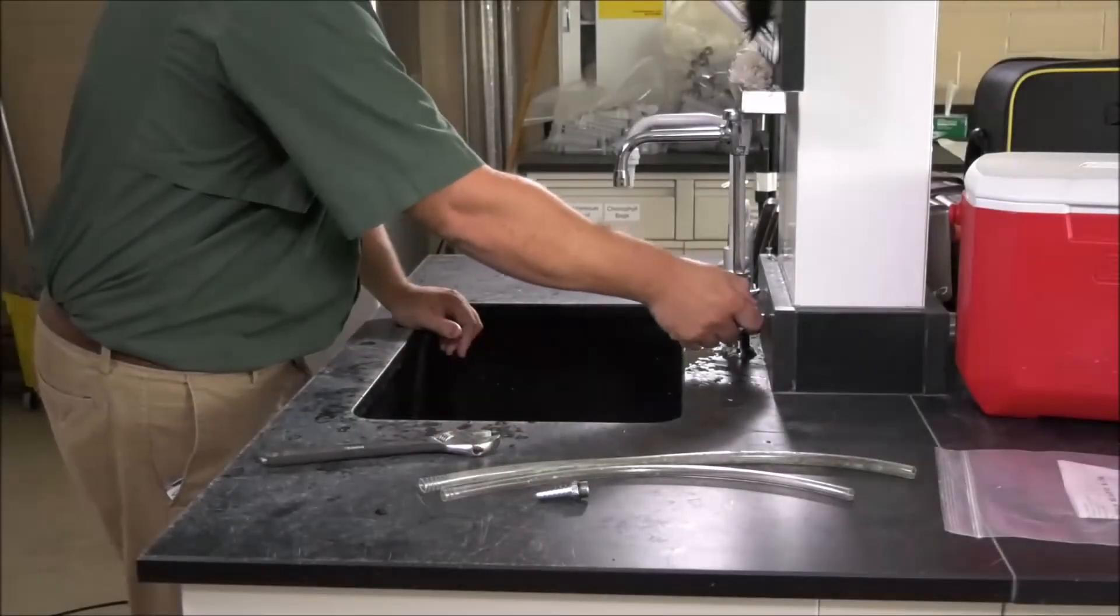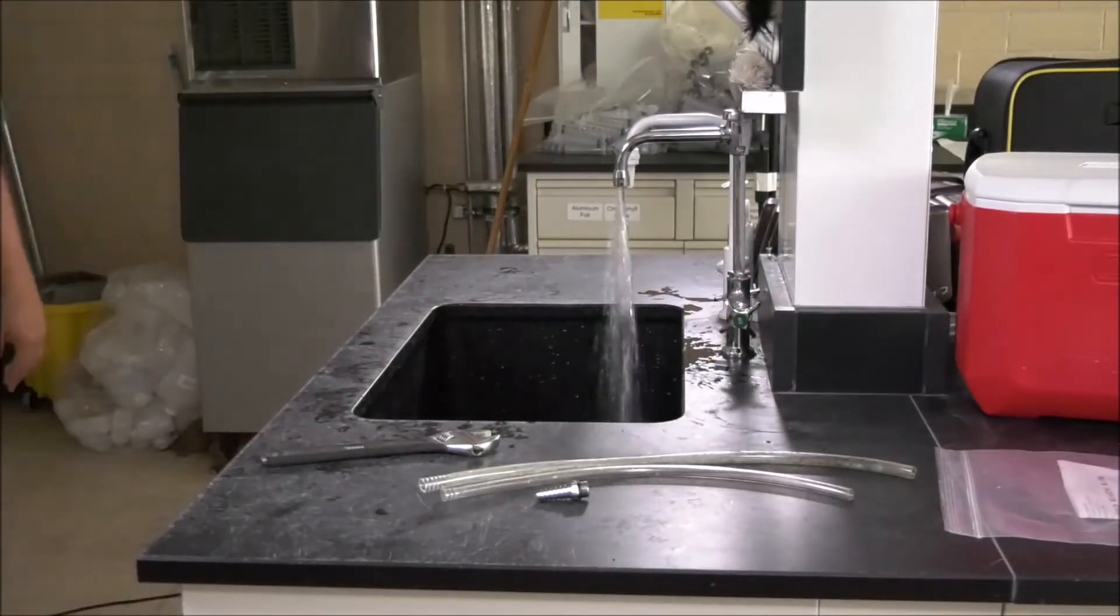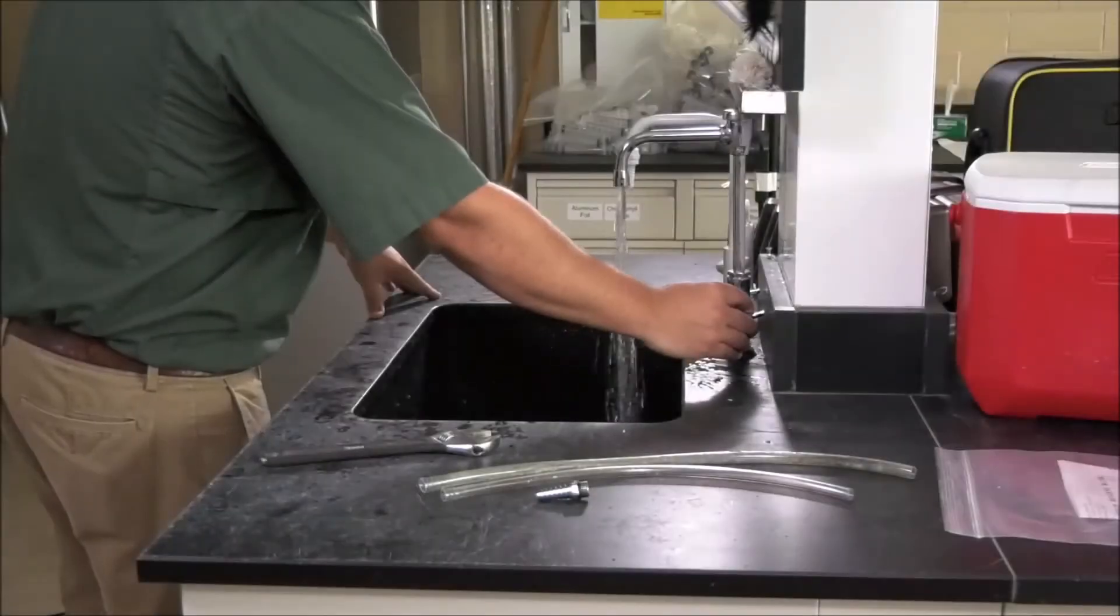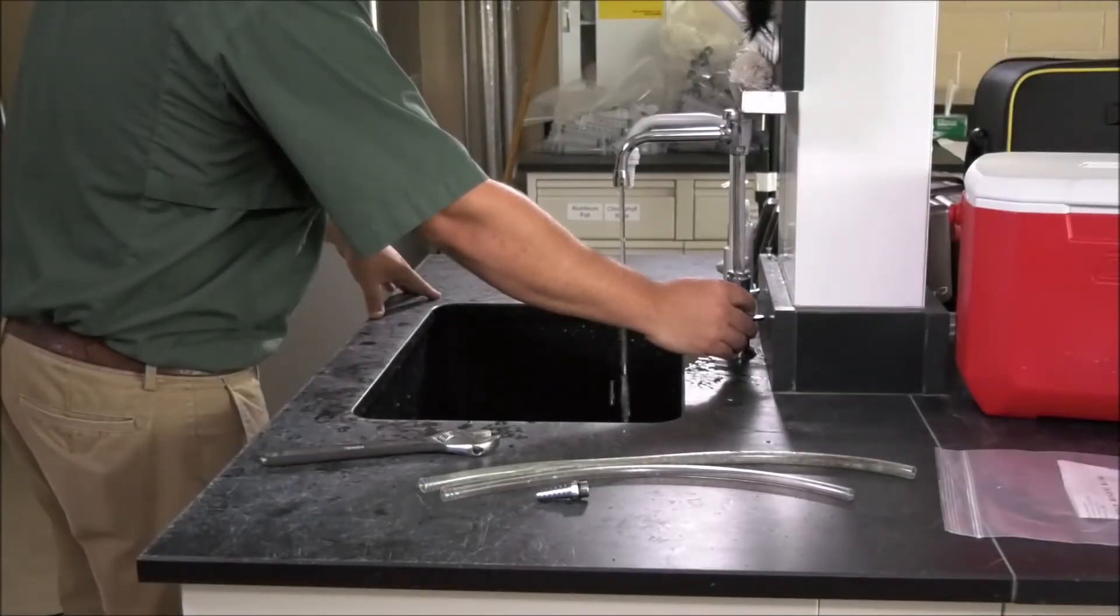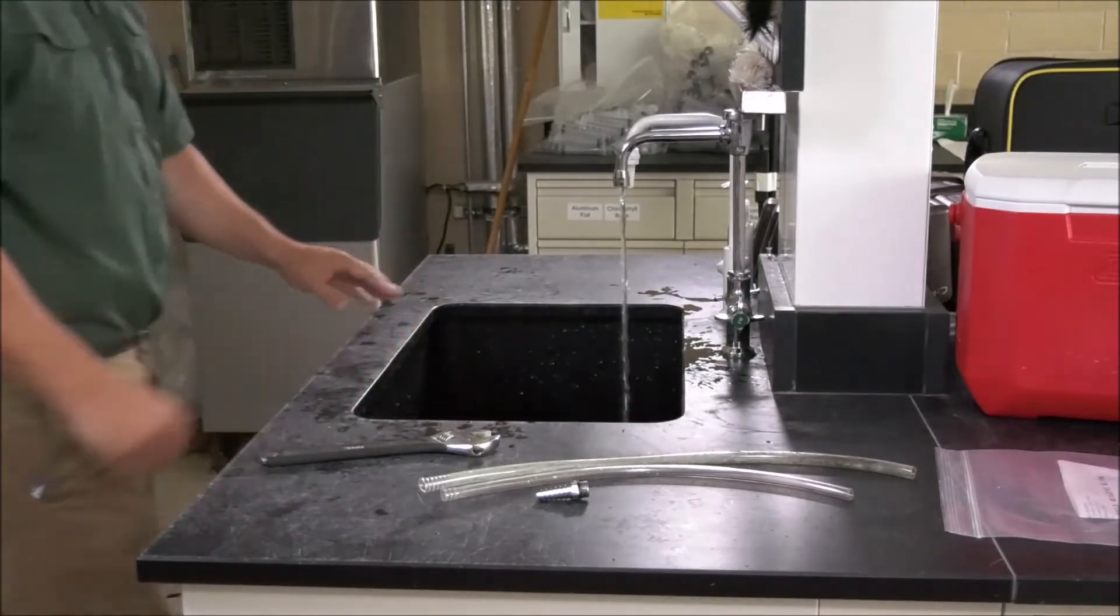Open the tap and let the water run at fast flow for approximately five minutes. After five minutes have passed, slow the water flow to the thickness of a pencil to minimize splashing.